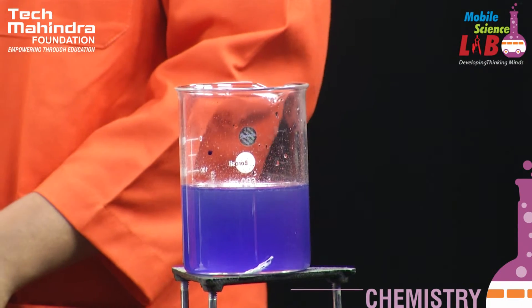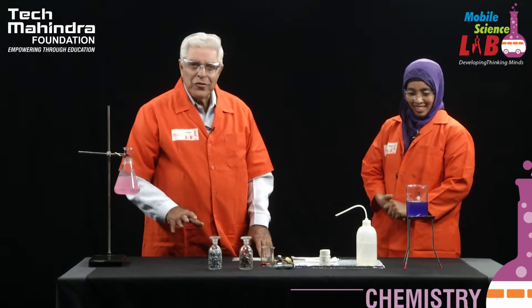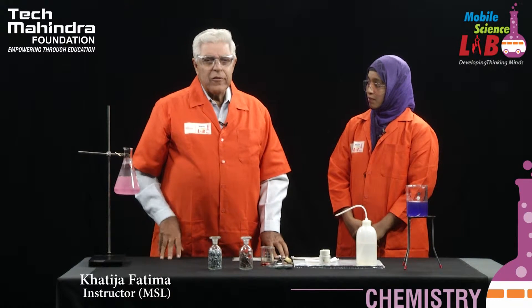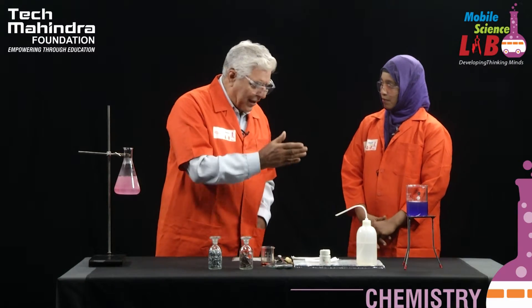That is the action of sodium hydroxide being dispersed into the solution. So viewers, you have seen that metals are of various types and their behaviour with water is very different. Sodium is very unique, and in fact there is a whole family in the periodic table which comprises lithium, sodium, potassium, rubidium, cesium, and francium. These are called the alkali metals and are the first group of the periodic table. All of them will behave in the same way, producing an alkali — and that is the reason why they are called alkali metals.